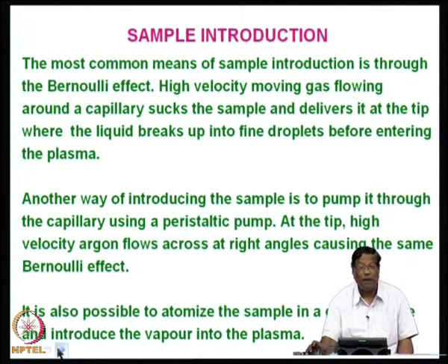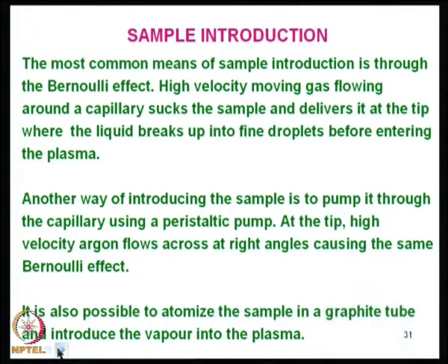So, the sample introduction forms a most important part of the ICP analysis, because the sample must be introduced in a continuous manner, so that there is no breakage of the plasma, and the sample must be introduced into the plasma in a reproducible manner.